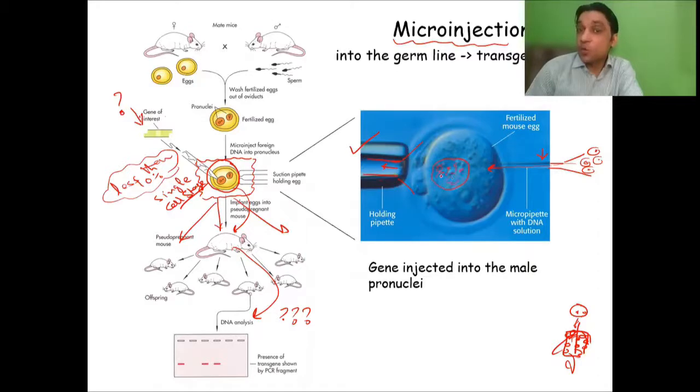And you know there are two chromosomes, now a pair of chromosomes there. Half of the chromosomes come from the sperm, the other half are already present here. So you are sending this thing right within the cells, assuming that those particles will be able to penetrate the nucleus, and then they will send the external DNA. It will become incorporated into the genome.